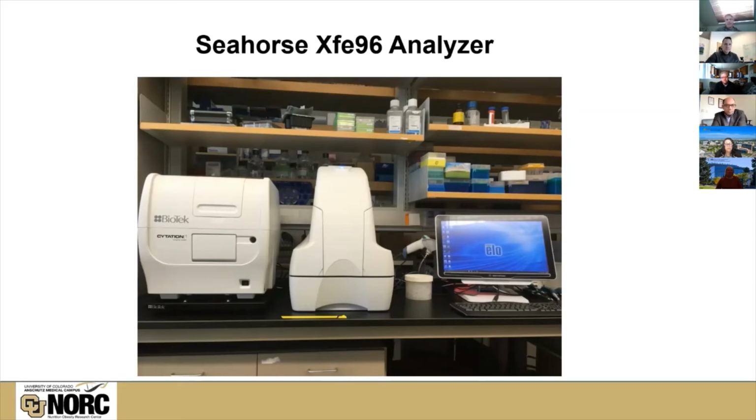The Agilent reps are going to be on campus this afternoon, and one of the questions I'm going to ask them is, what is the O2 content and when can I see the O2 content? Right now, all I know is the O2 rate, the rate of oxygen consumption. I don't really know how low the O2 goes or how you would know if it goes too low unless you started seeing inhibition on your cells.